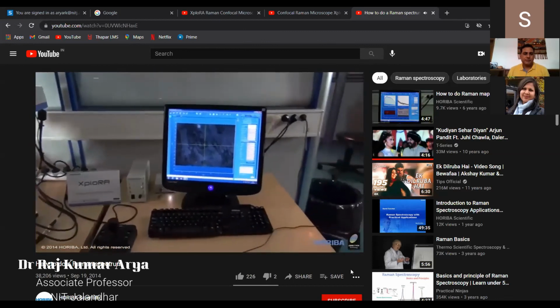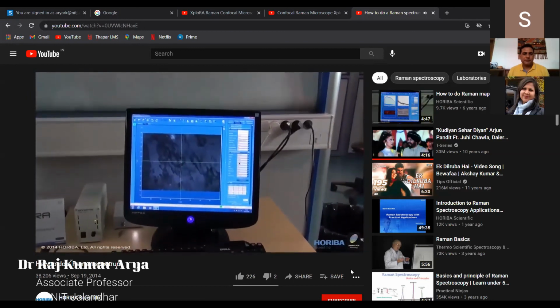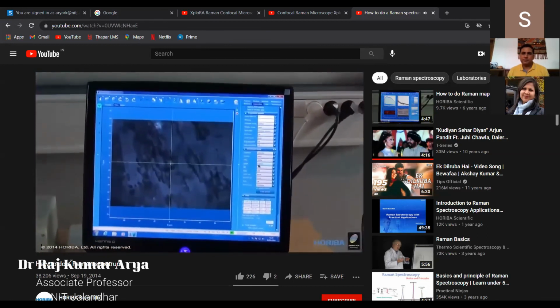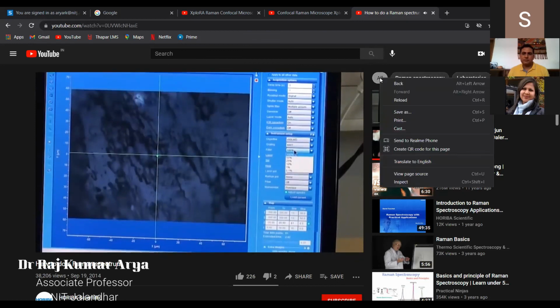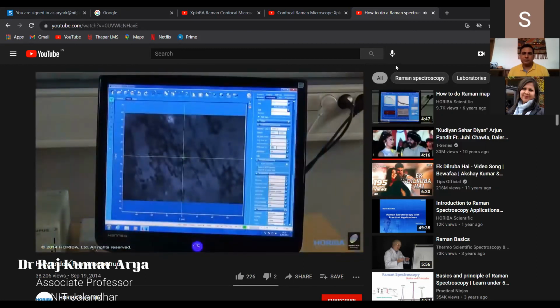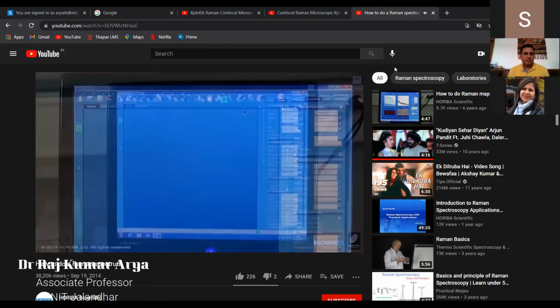Let's choose the acquisition parameters. First, the excitation wavelength in this case will be 532 nanometers. And the grating will be 600 grooves per millimeter. Because the sample is not photo or thermosensitive to the laser, 100% of the laser power will be used. An acquisition in real time will be launched for 0.5 seconds.